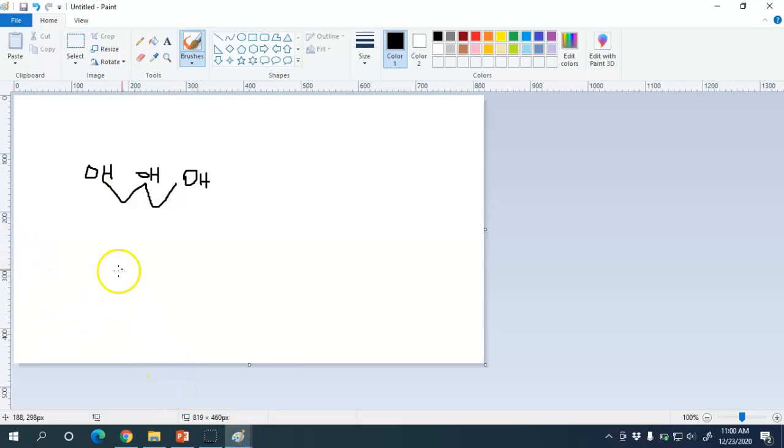Okay, let us continue. For example, if you have functional group of glycerol, this is the structure for glycerol. We have three functional groups, OH, which is hydroxyl. So by using FTIR, you can determine whether there is the presence of the functional group in the modification of the polymer unit. For example, if you want to incorporate glycerol into the styrene structure, you need to observe the OH functional group by determining the wave number of the OH functional group in the IR region.